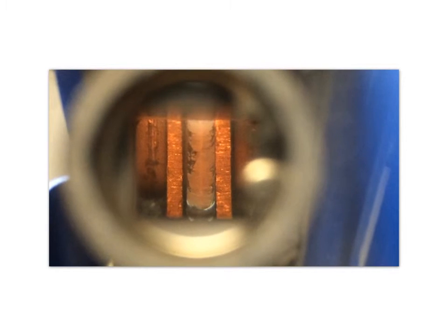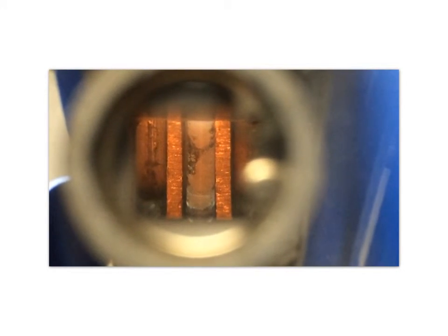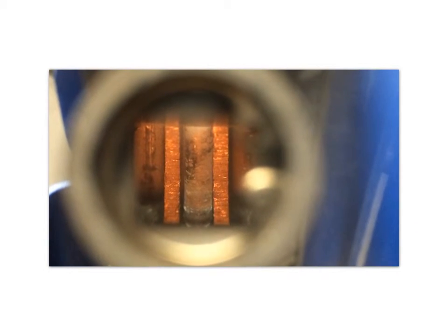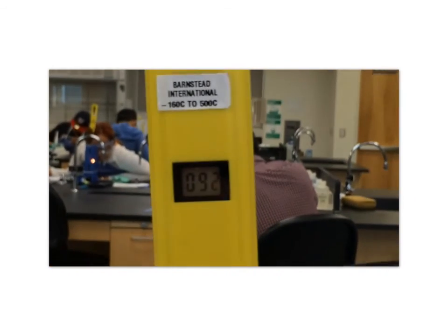And it is a very small volume, and even the slightest relaxation or contraction of the fingers could release the solution or absorb some of the unwanted solution. This could have affected our melting point results.